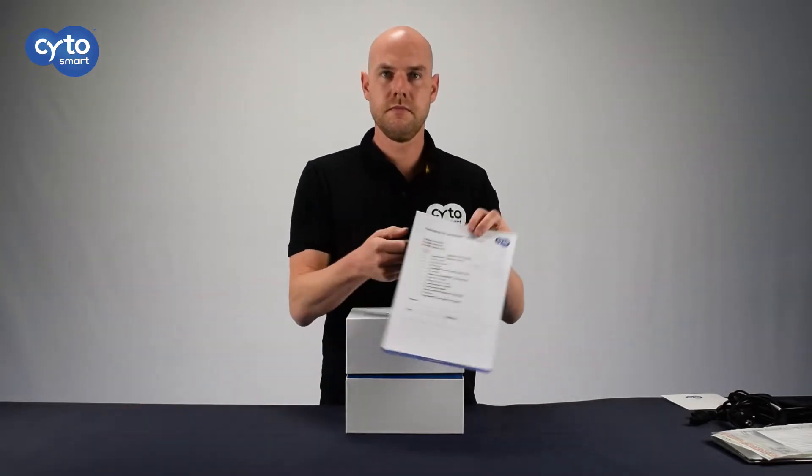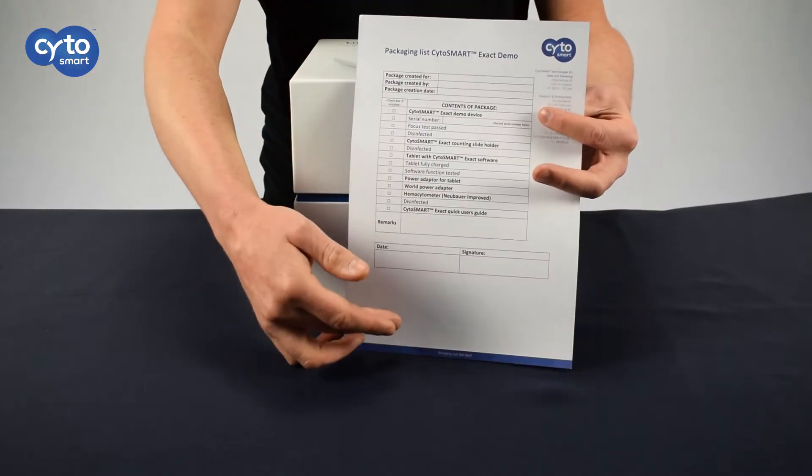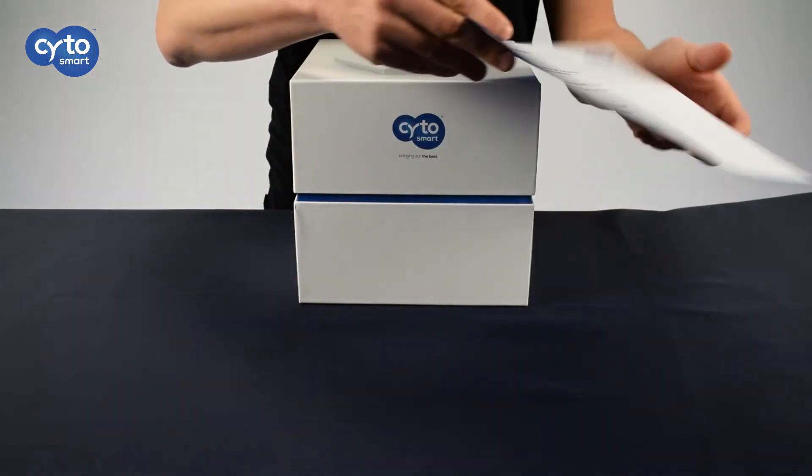Lastly, you will find the packaging checklist, ensuring that you have the correct contents and that the right contents are returned when necessary.